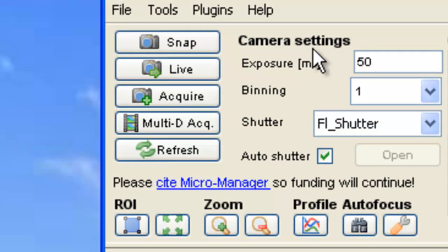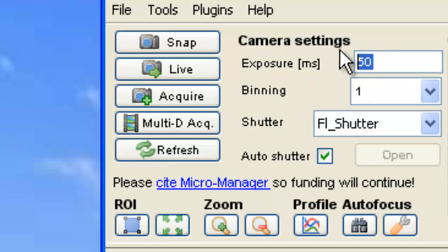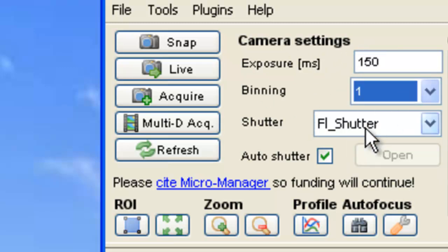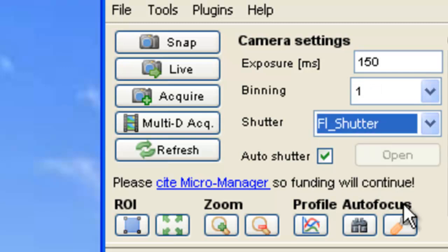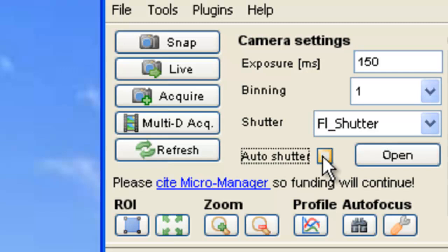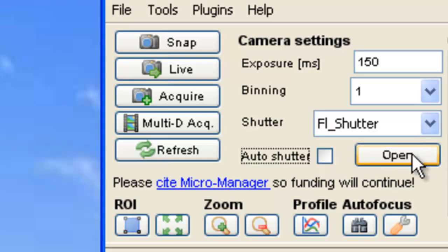Under the camera settings, you have the option to change your exposure rate, binning, and select the shutter of your choice that may be available to you. The auto shutter opens the shutter when the camera begins exposure and closes it immediately afterwards.